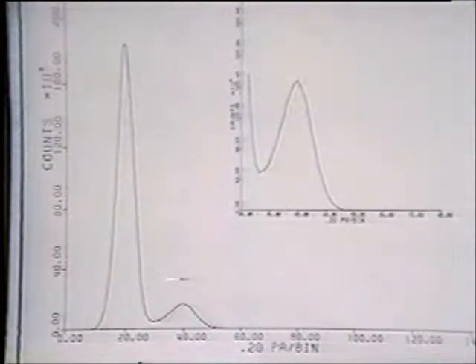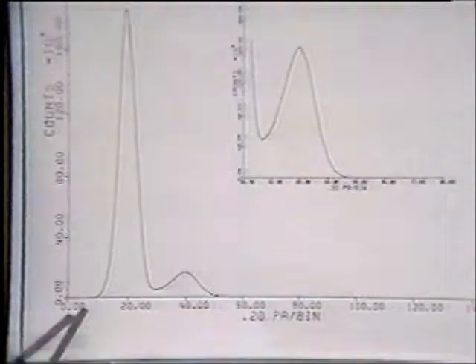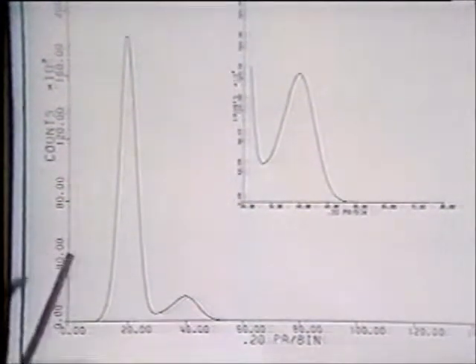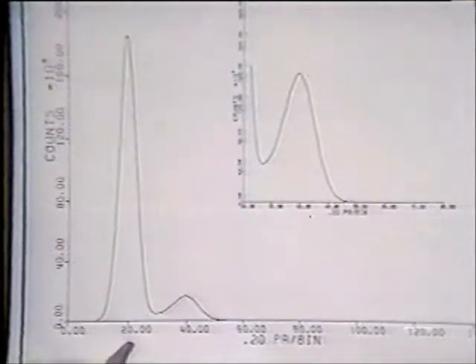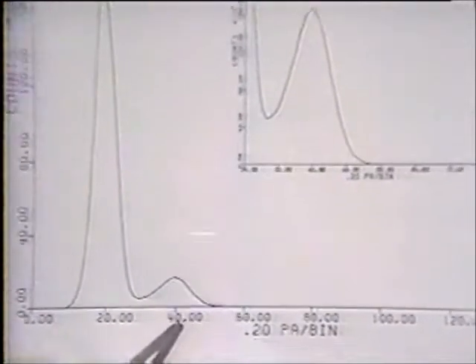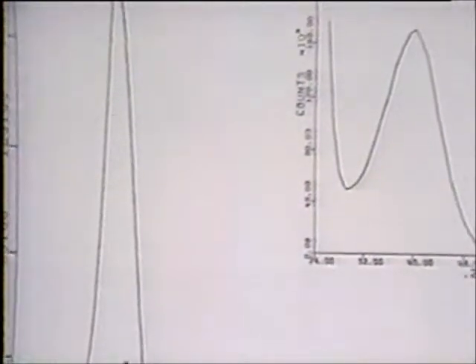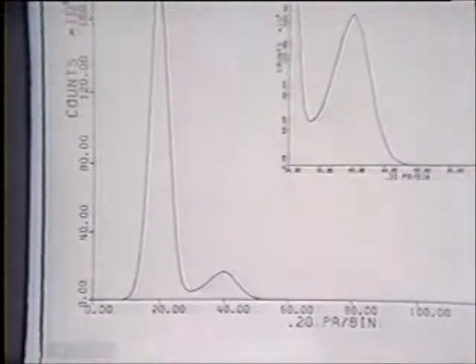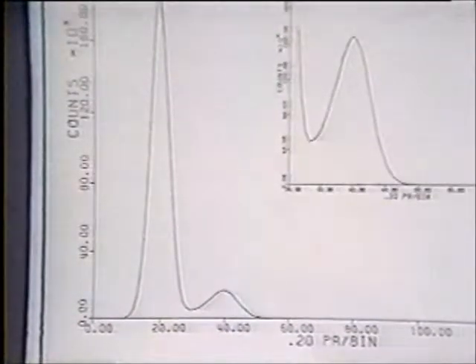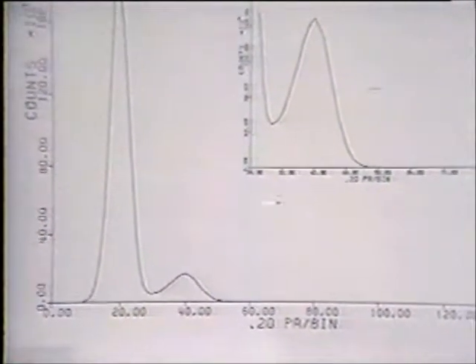The amplitude information can be examined in a couple of different ways. This is a raw amplitude histogram of the data after correction for baseline offsets. This actually represents zero current. And you get a big peak indicating that the channel spent most of its time at baseline. This peak occurs at an amplitude equal to the single channel current. There's almost an invisible amount of extra activity in this record.